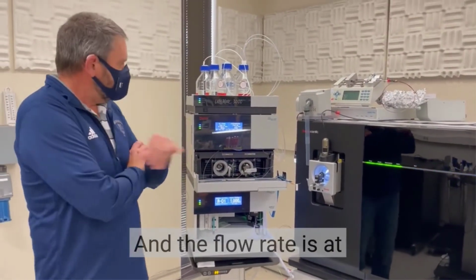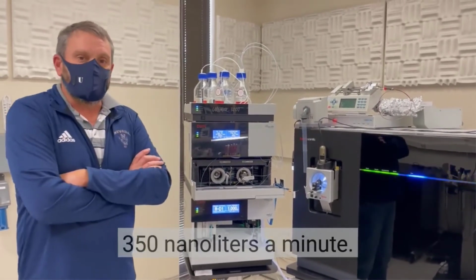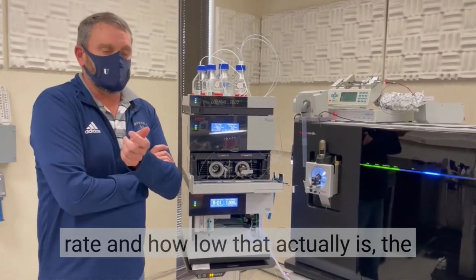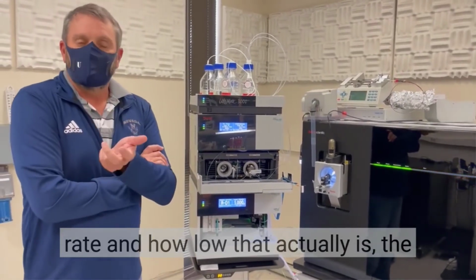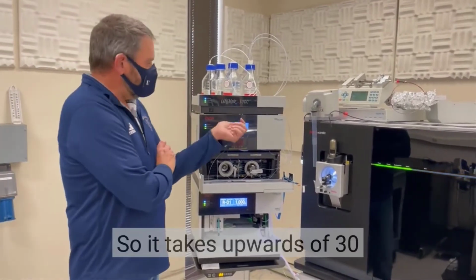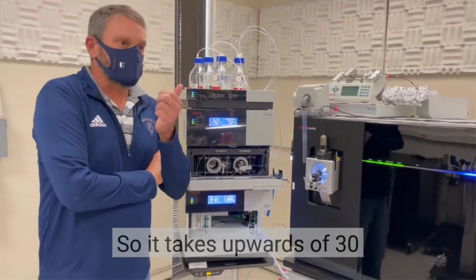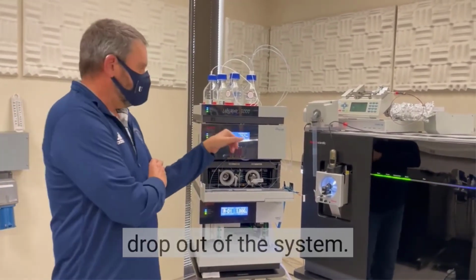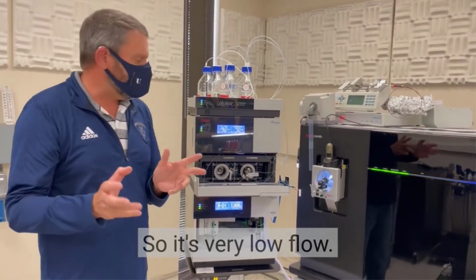The flow rate is 350 nanoliters a minute. To get a perspective of how low that is, a drop of water is about 10 microliters, so it takes upwards of 30 minutes to get a 10 microliter drop out of the system. So it's very low flow.